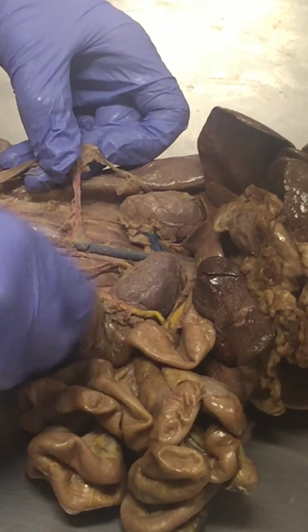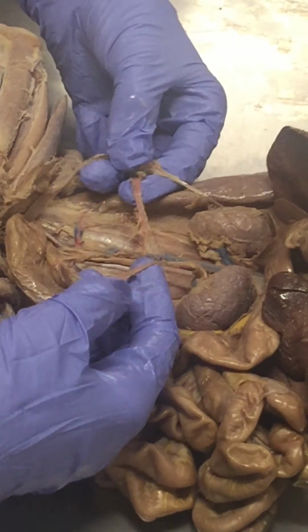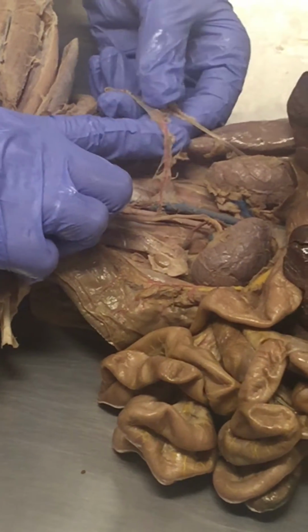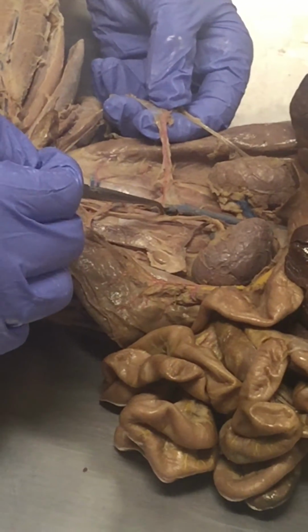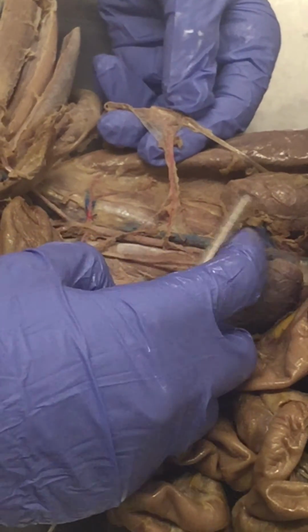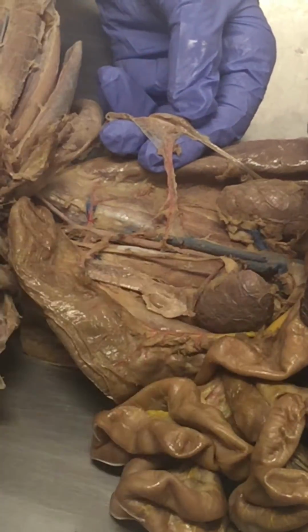See this, so here's the uterus, the uterine horns, and the ovaries. You see how there's a little red artery going to both of these? So this artery is going where it's supposed to. It's coming off of the aorta below where the renal arteries are, and it's going to the ovary. But this other one, it's coming off of the renal artery, which is really weird. It's doing really weird stuff, so it's not doing what it's supposed to.